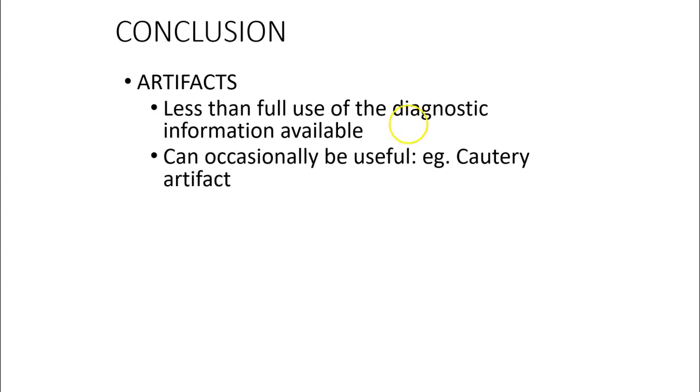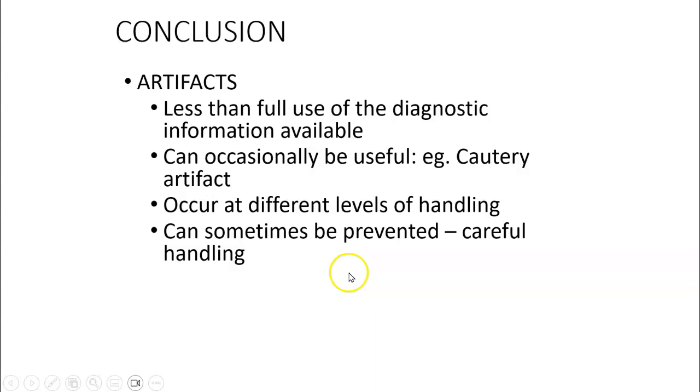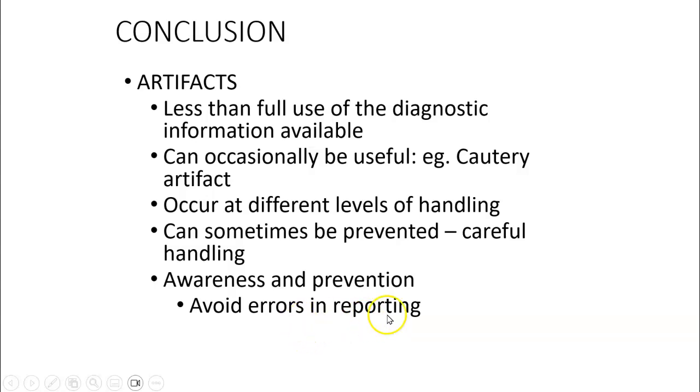So in conclusion, artifacts may result in less than full use of the diagnostic information available. It may hamper the diagnosis or evaluation. It can occasionally be useful, such as cautery artifact. It can occur at different levels of handling, so a good understanding of the different steps is very important. And they can sometimes, in fact, often be prevented with careful handling. And awareness and prevention are of the utmost importance to avoid errors in reporting.